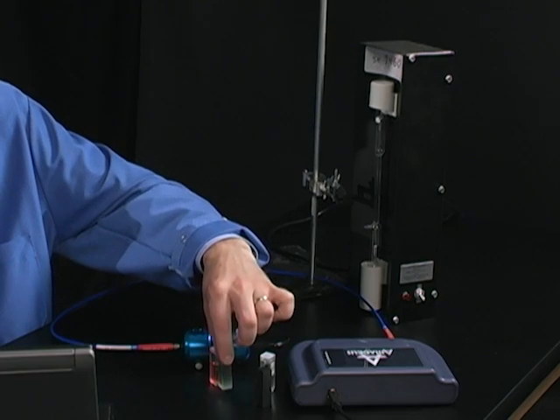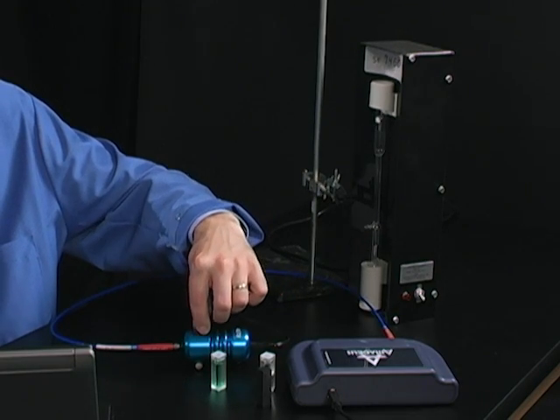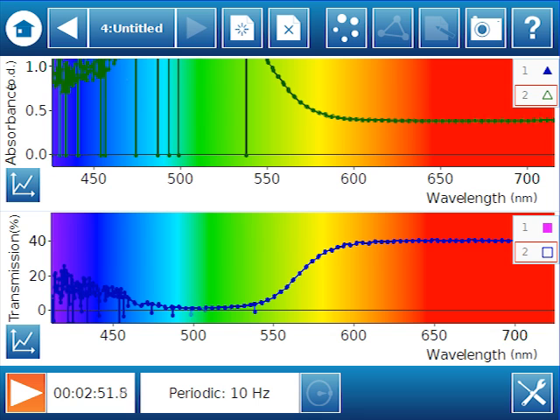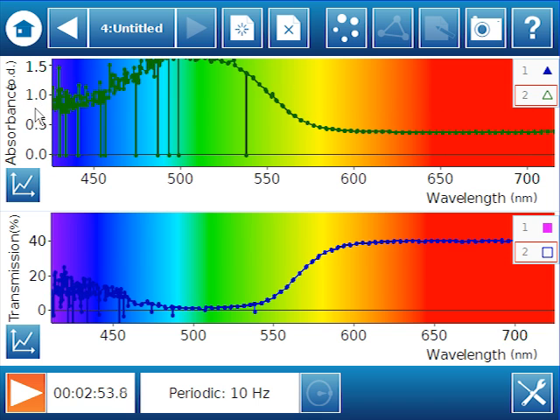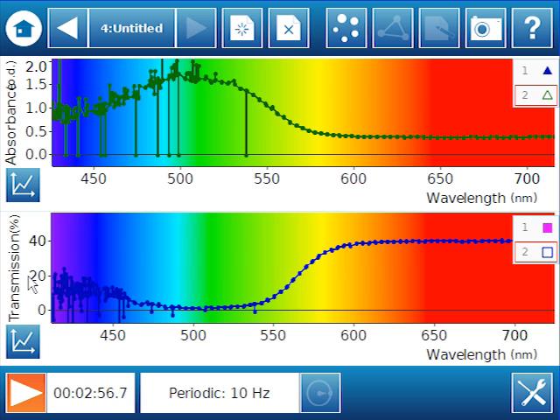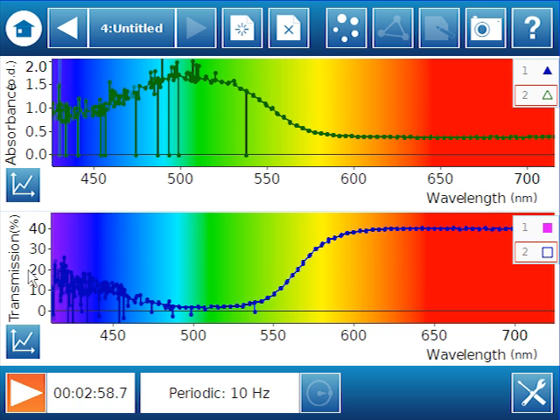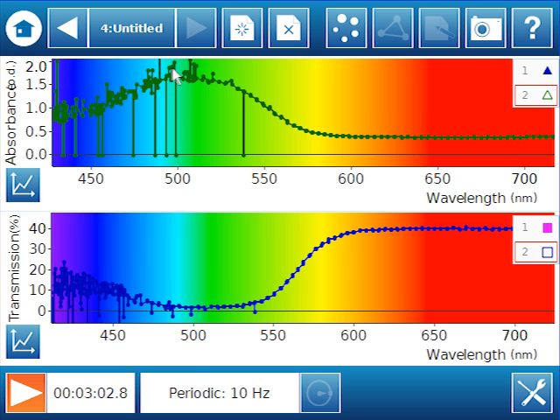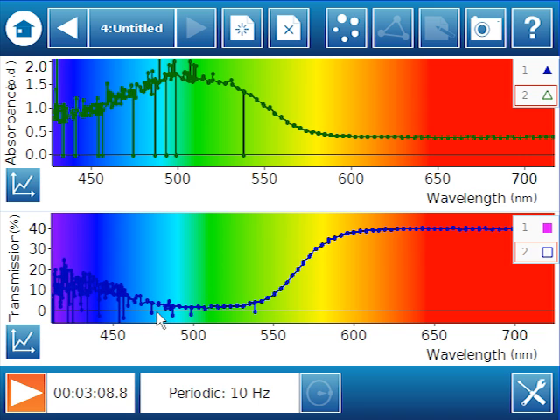And we can go back to our intensity graph just to see what's going on for the red. So on the red, I'm getting a little bit of noise in this part of the spectrum, but we'll see what's happening over here. It is absorbing lots of this blue-green, not absorbing any of the red. That's why it appears red. And over here it is transmitting lots of the red and not transmitting lots of the blue-green. So we have this inverse relationship between these two things.